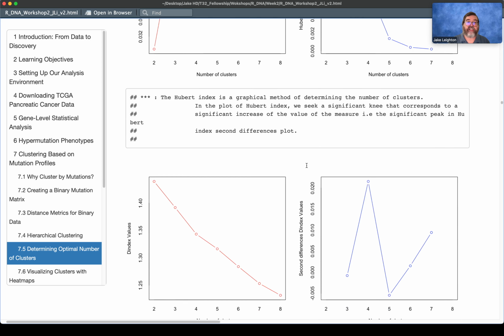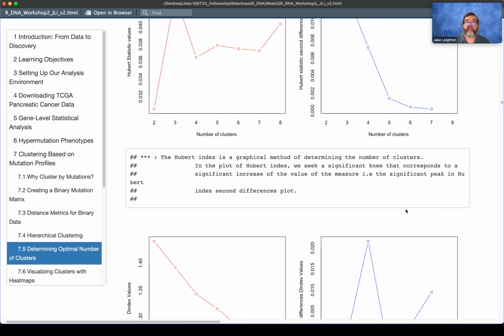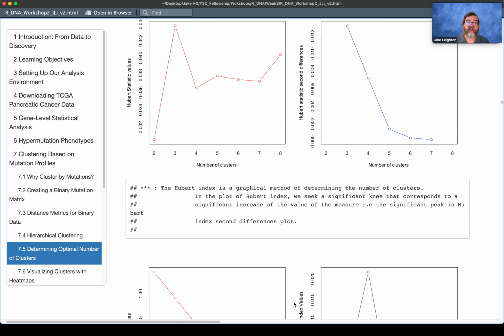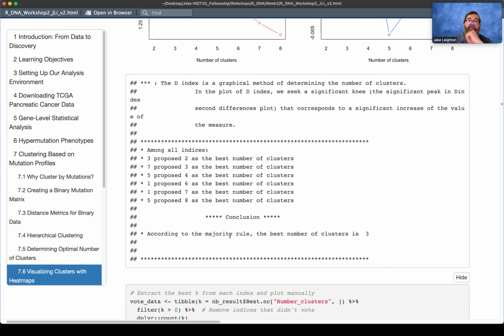And we're going to skip this part here. This is kind of in-house things that NbClust does, but I think we'll just skip to the end of that, and basically it went and looked at 30 different things, and it found a certain amount of consistent ones, and basically you see here 3 different methods said 2, 7 said 3, 5 said 4, 5 said 8. So there's a lot of discrepancy among the different methods. This is kind of a hard choice to choose number of clusters. But looking at the in-house NbClust, by majority rule, it's going to be 3.